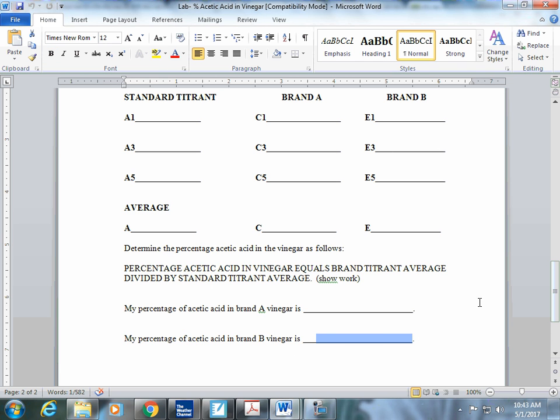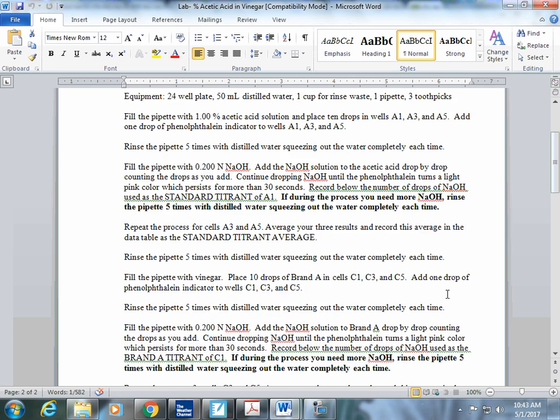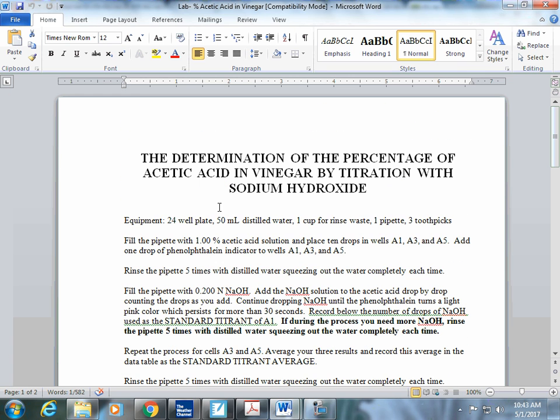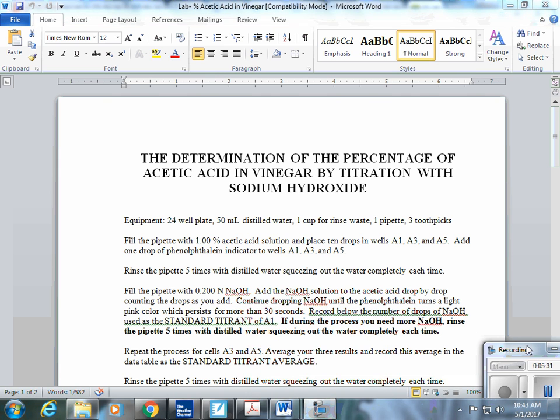Okay? So, not a terribly tough lab procedure-wise. This has been Mr. Braun, the pre-lab video for the determination of the percentage of acetic acid in vinegar by titrating with sodium hydroxide. Chem students, let's investigate.